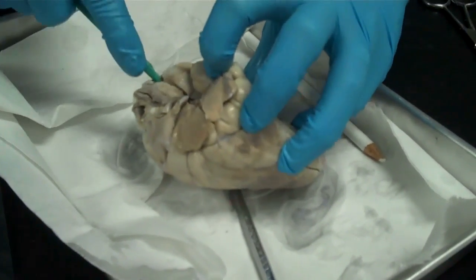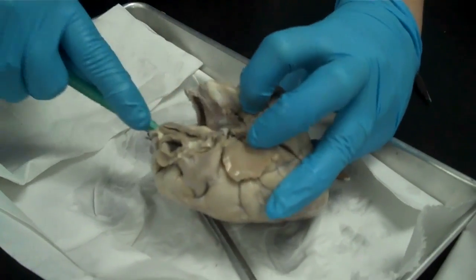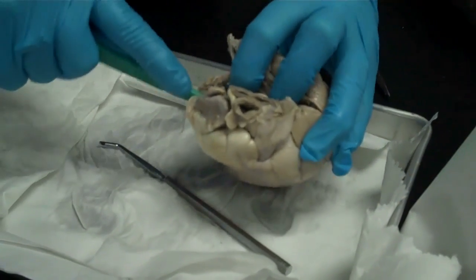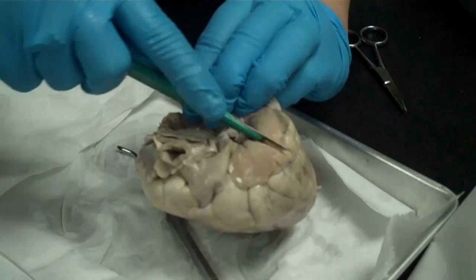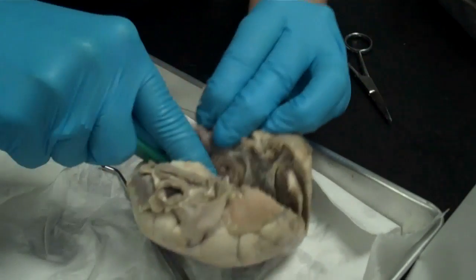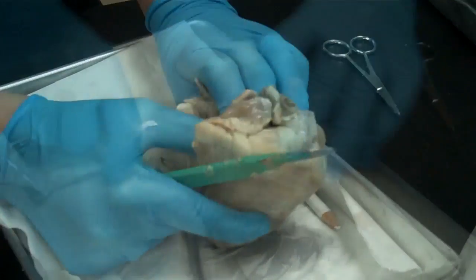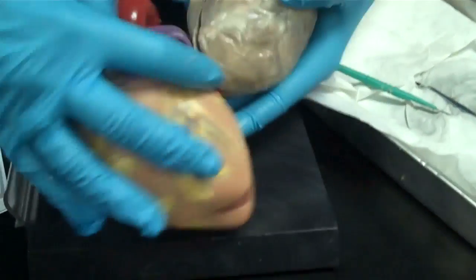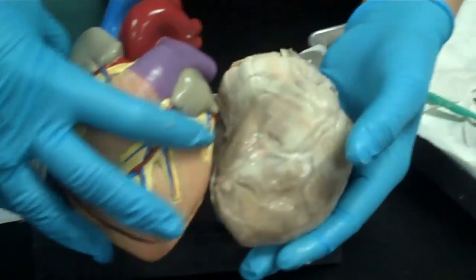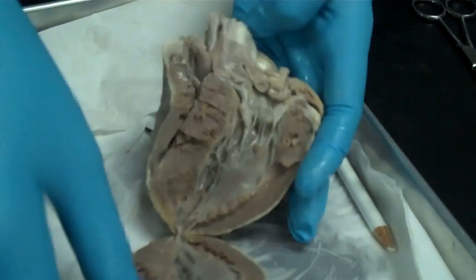The heart is a muscle, so you do have to actually put a little bit of work into the cut. Here we go — open that up. It's not entirely perfect. Look at the model. From the inside, you can see some of the structures.